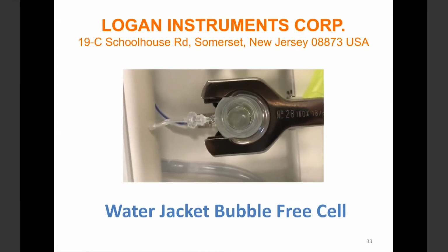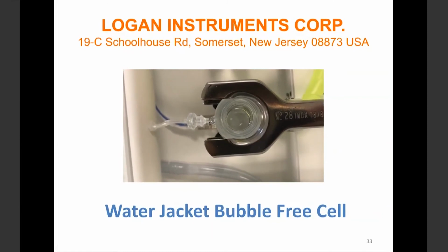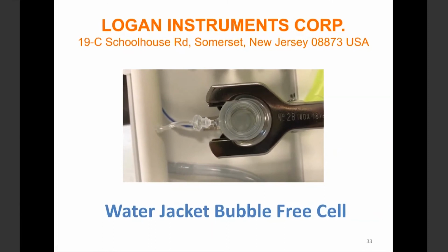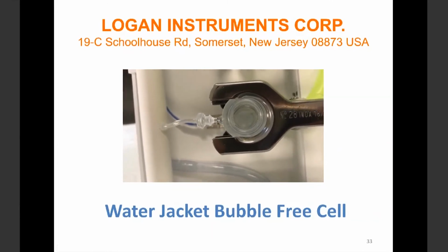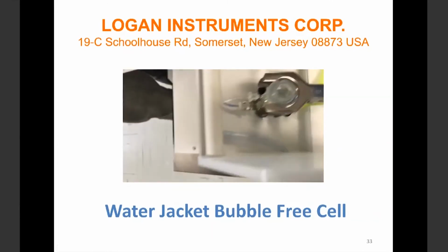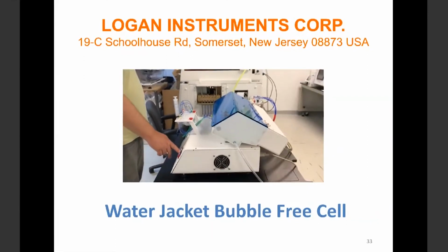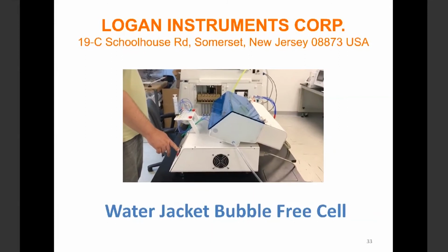So fill the media from the bottom, then you can see the air bubble goes out. So after you fill the cell, you can put the cover and then lower the head and then start the test.